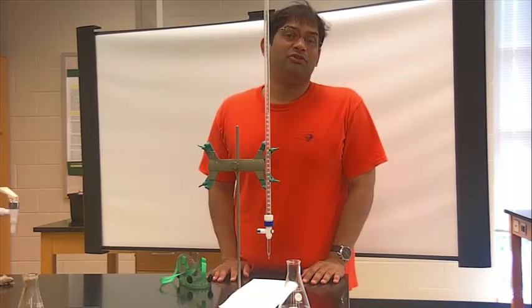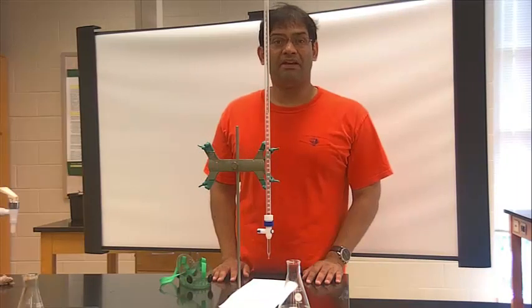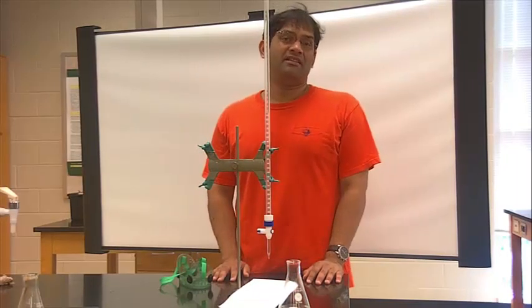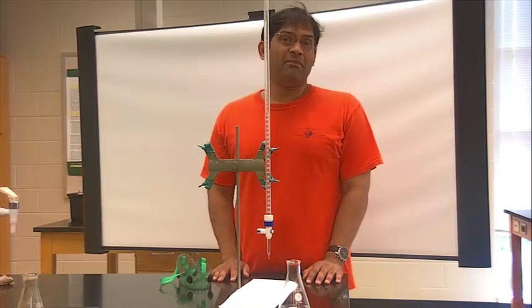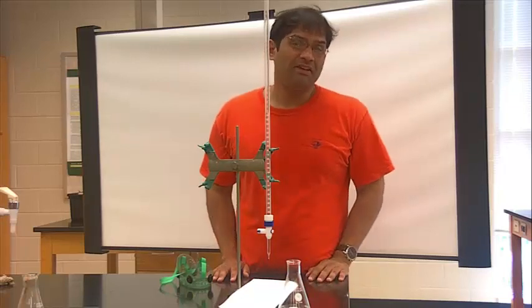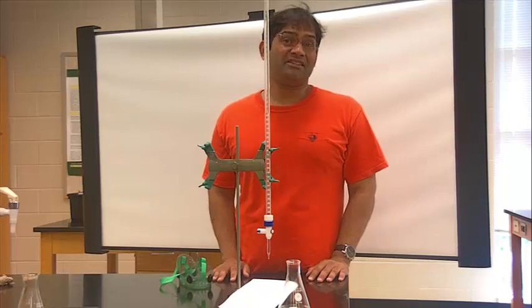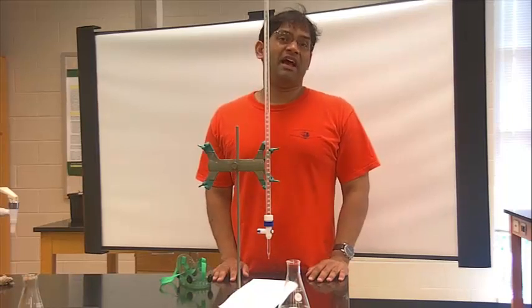From that, you'll do calculations that are listed in your lab handout and your lab protocol to determine the solubility, S. From that solubility, you will plug it into your Ksp equation for calcium iodate, and from there determine the Ksp value of calcium iodate.